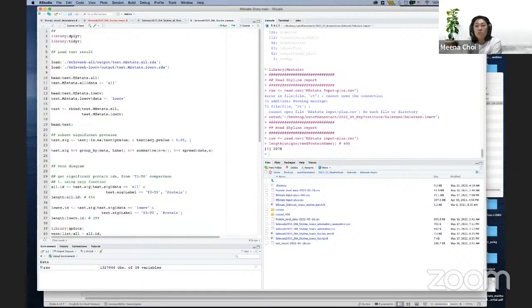They also provide some linear models, but you have to define what is best for yours, which means they have a lot of flexibility, but you still need statistical knowledge to make the right decision. And sometimes we have the diagnosis too. MSstats does not provide multiple ways, but we want to provide the best without requiring your decisions. So it is really hard, because MSstats has only one best model, but Perseus has multiple outputs that can lead to conclusions. So I think this is not a fair comparison. They definitely have pros and cons, but it's really hard to compare the performance itself.